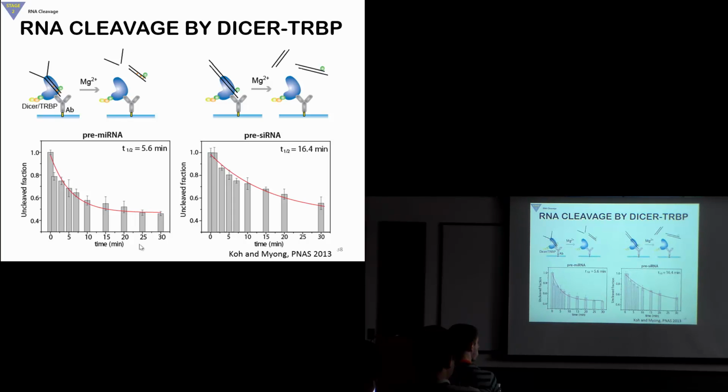Up to that level, fluorescence intensities become slightly brighter at higher temperature. But in FRET imaging, they both become brighter, so FRET efficiency is not changed. pH 7 to 8. We can go down to about 6. We don't like going down to 5 because things don't function.